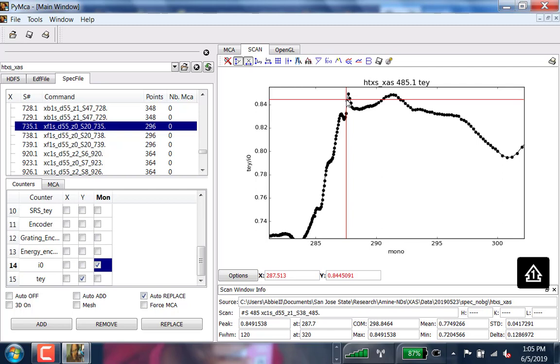Why? Because there is a bond there which should correlate with a carbon-oxygen bond, carbon-boron bond, or maybe something else. And this is important. Remember, this is only carbon. So we are only probing the type of bonding environment around the carbon atoms. And since everything else in our system is diamond below, these are only those carbon-related bonds that are happening at the surface and above.